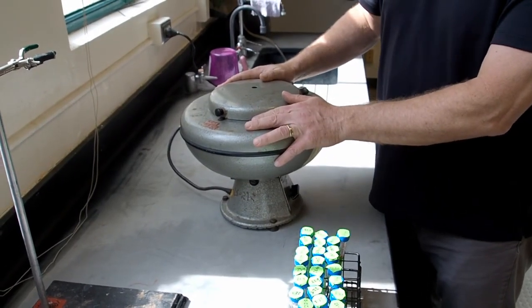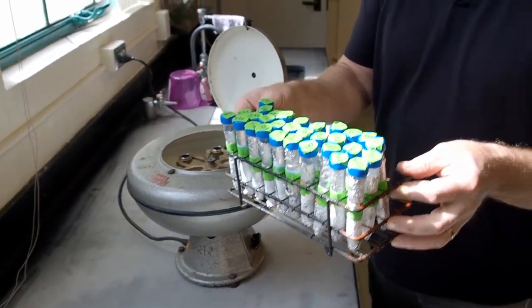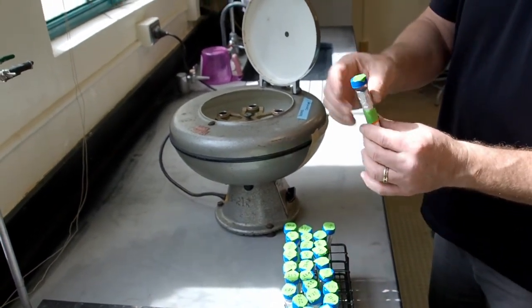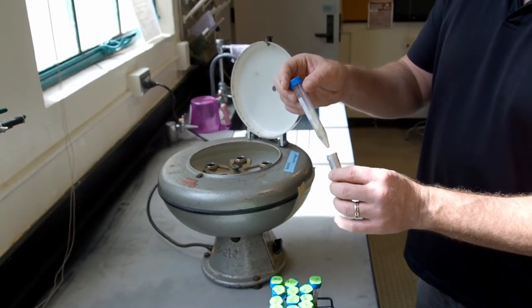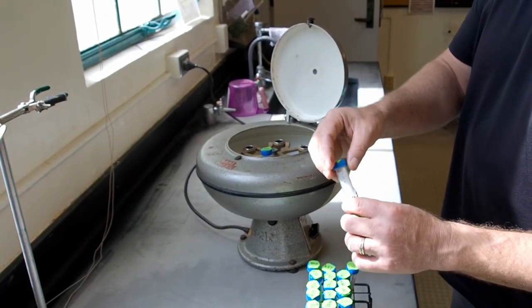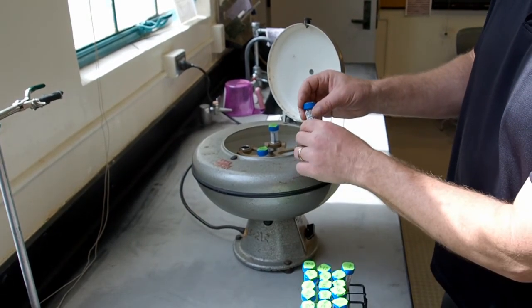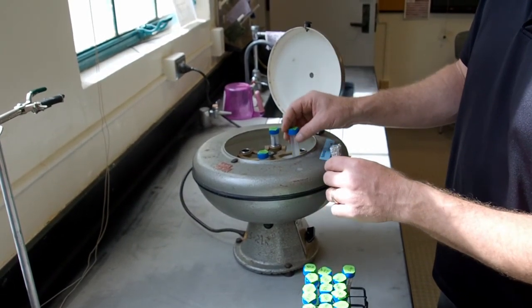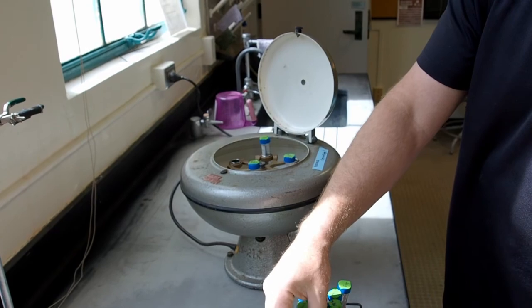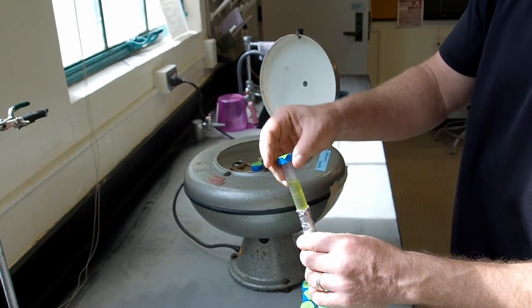Okay, next step is going to be to centrifuge our samples. So here are a number of chlorophyll samples that have been sitting in the freezer, extracting in acetone. And we have them labeled so we know where they came from. And we're simply going to put these in our centrifuge, and we're going to spin this so that our liquid is retained, and all the solids go down to the bottom of the tube. So the solids will go to the bottom of the tube, the liquid will remain, and we can then use our spectrophotometer to analyze the liquid, the color in the liquid.